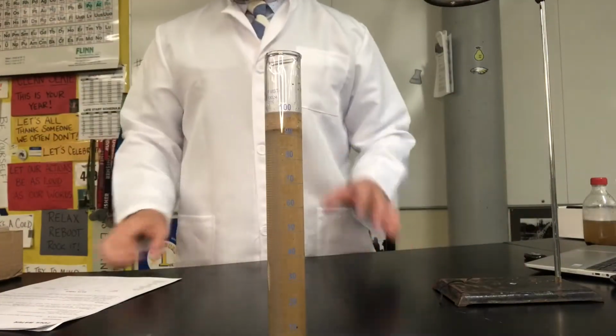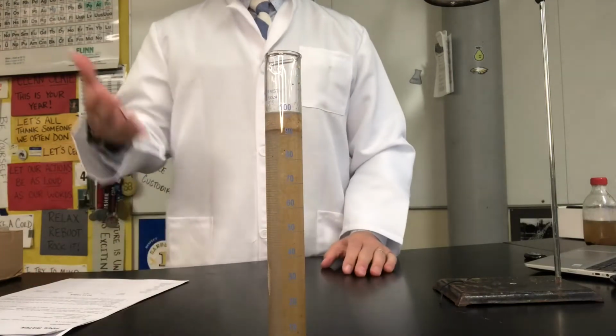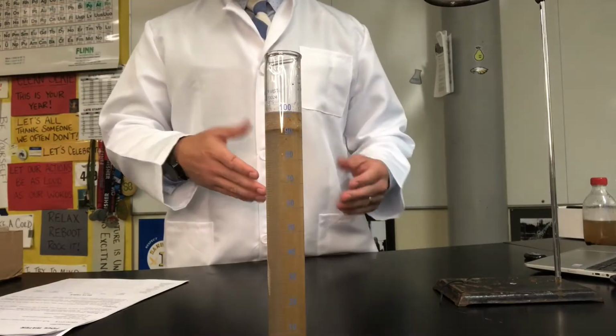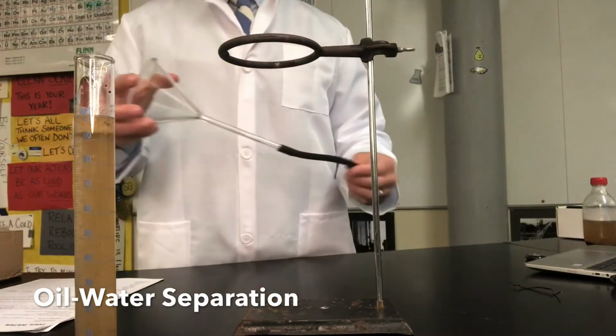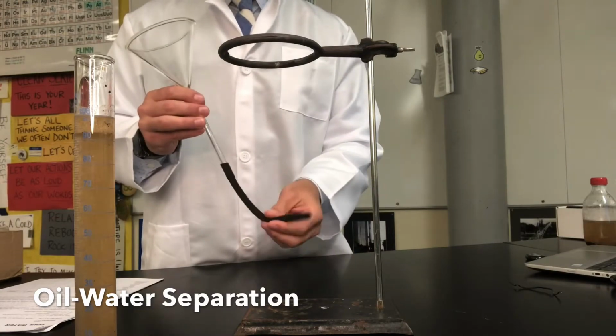So we've started our initial before treatment observations in our data table. Now we're going to work to our next part of the lab, which is going to be oil-water separation. After we do that, we'll then take data again. For oil-water separation, we're actually going to be using a glass funnel with a little tube at the end, okay?